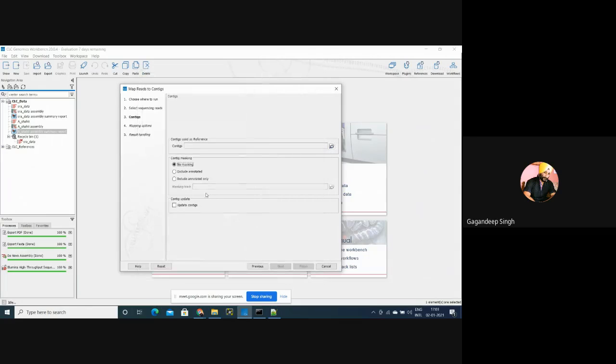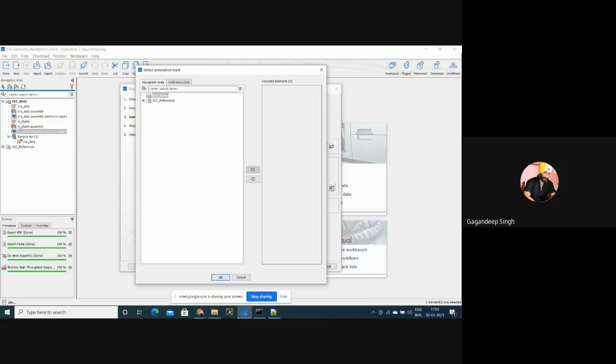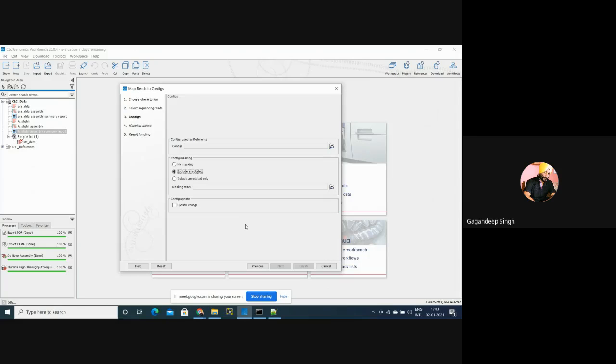This is not working here. Might be mask. I'll do this work by using Linux only. This is not working here.